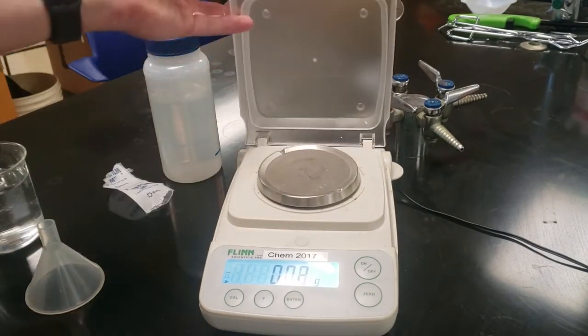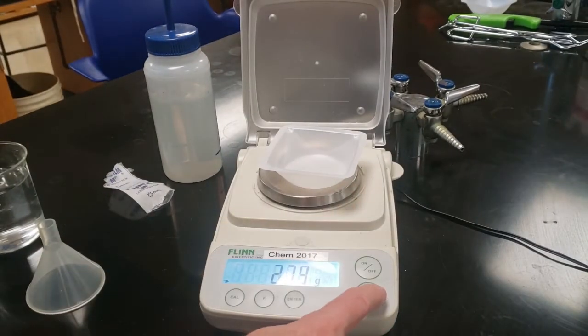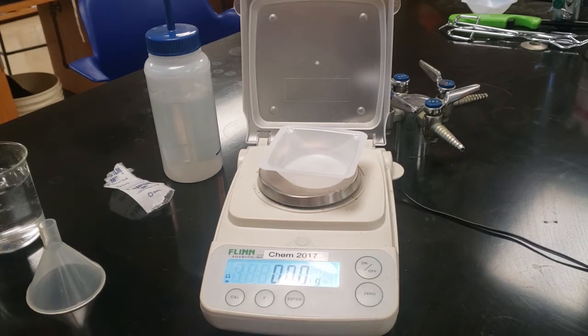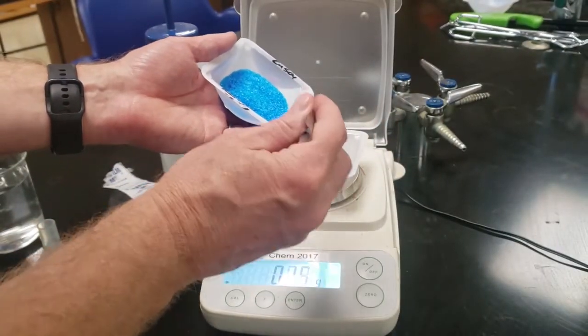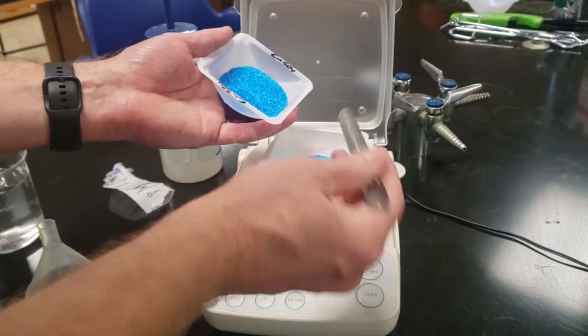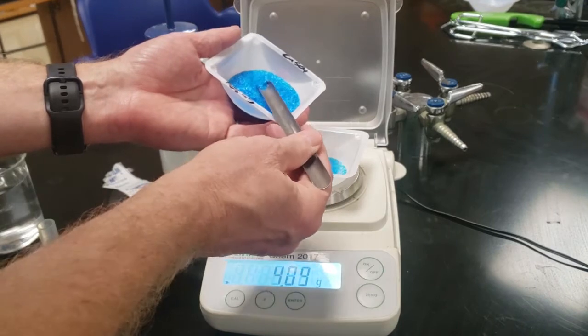Here we're going to lift the lid up. Put the weighing boat on there. Push tare or zero and it makes it zeroed out so that it doesn't weigh the actual boat. It starts from whatever you put on top of that. We're going to put this right on top of it because you guys will spill it. And if you spill it, it goes right in there.